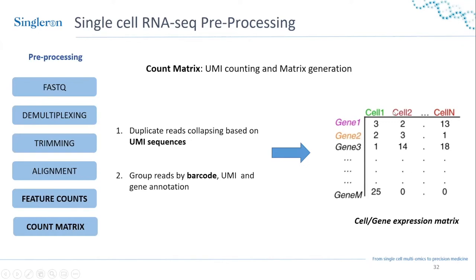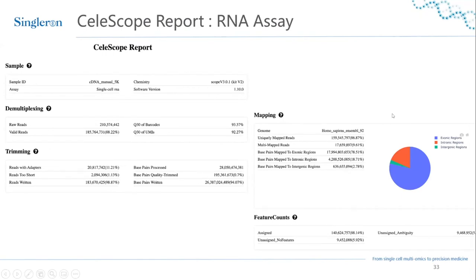After running CeleScope you get a report summarizing every step of this process: the sample ID, software version, demultiplexing metrics showing how many raw reads were valid, trimming results showing reads that were too short, and mapping statistics showing which genome version was used and how many reads were uniquely mapped. Unique mapping is important because you want each read to map to only one place in the genome to correctly identify the gene it belongs to. The report also shows where reads mapped — to exonic, intronic, or intergenic regions.